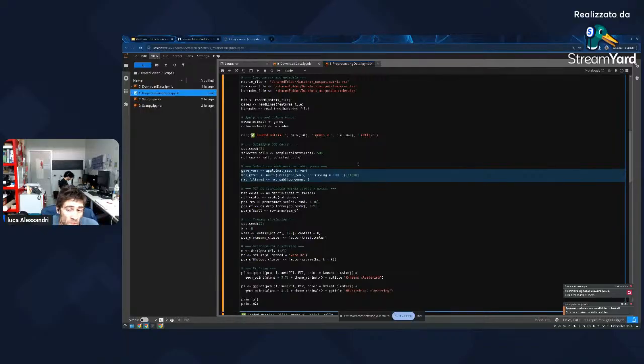But maybe 1,000 is too few, maybe I want more. So always, whenever you do clustering, start big. And then if the picture doesn't really reflect your biological question, you can work on the data, okay? Just be aware that working on the data does not mean stressing the data or manipulating the data, okay? These are two different things.